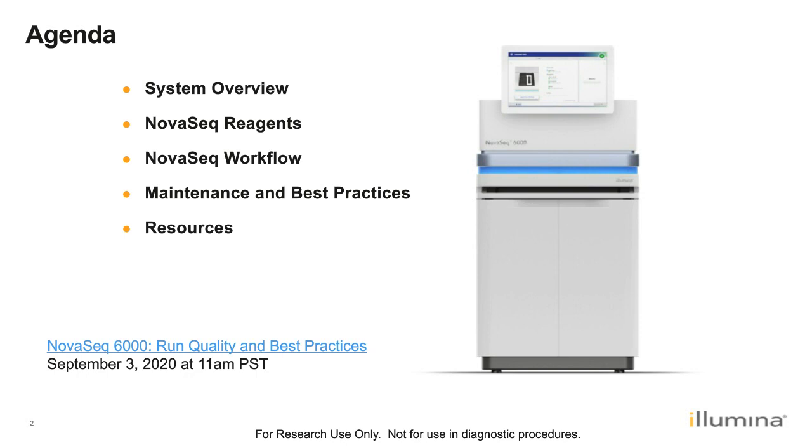So for today, for this webinar, we will be going over a system overview, what reagents are available for the NovaSeq system, the NovaSeq workflow. So this will be ranging from upstream library QC and loading, as well as briefly covering some available analysis options. And then finally, we'll lightly touch on some maintenance and best practices for this instrument.